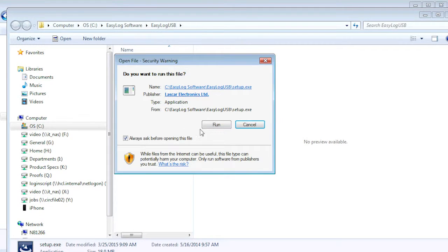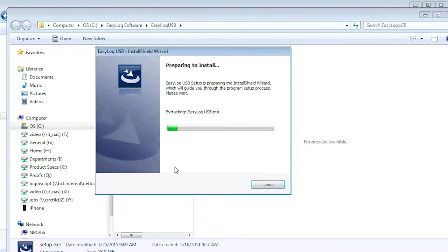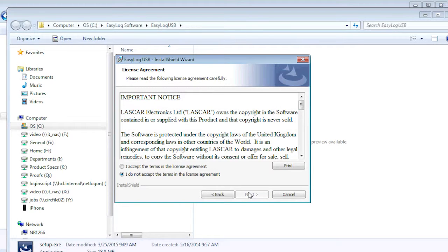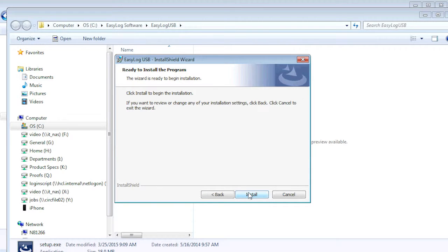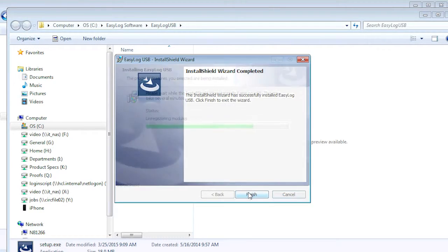After a few moments, the software install wizard will begin. Installation is straightforward — just click on Next to proceed. Accept the license agreement, click Install, then Finish.